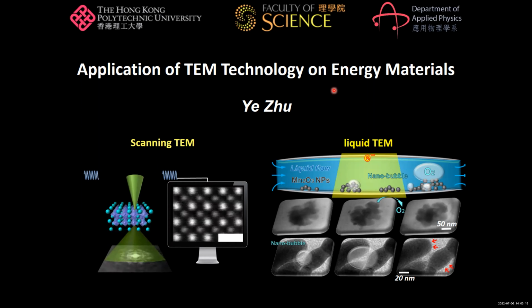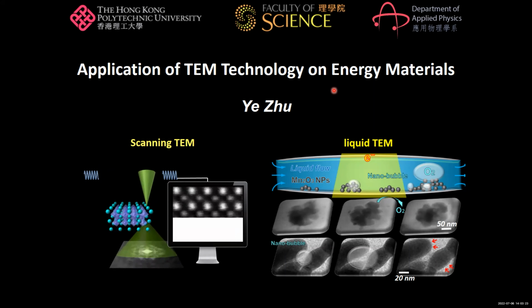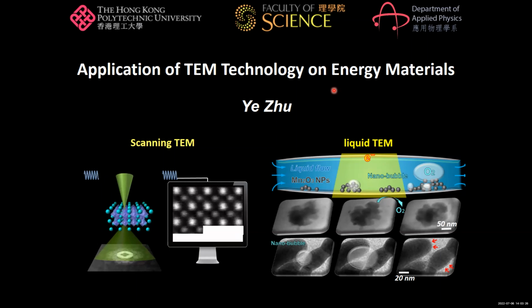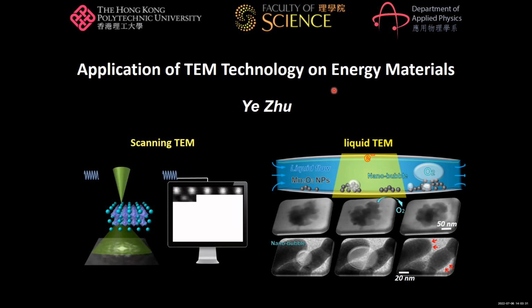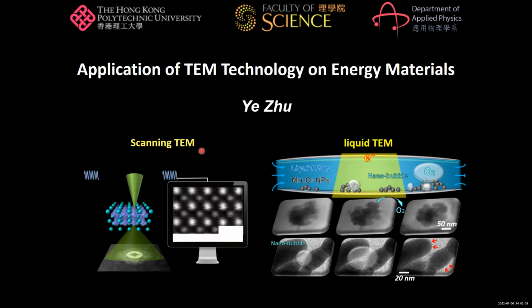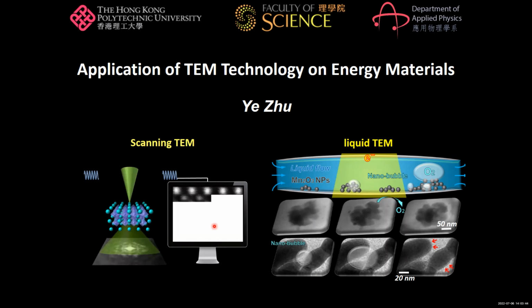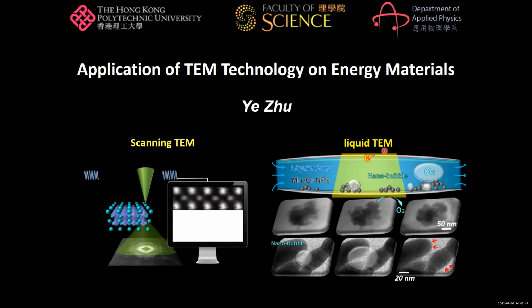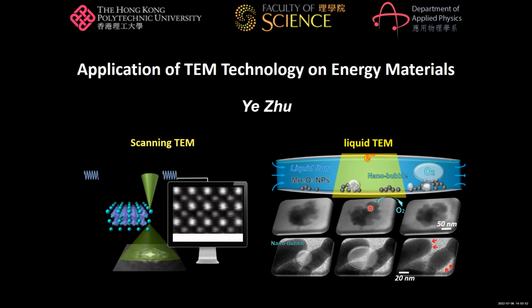So my group is specialized in TEM technique and its application on material characterization. Different from most of the previous talks, which focus on a particular energy problem, my talk will focus on the TEM technology and how it may contribute to energy material research. That includes using scanning TEM, or STEM, to image the atomic structure and the lattice distortion in energy materials, and also in situ liquid TEM to directly capture the reaction dynamics for OER catalysis.